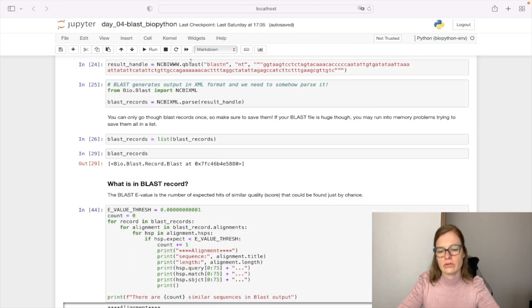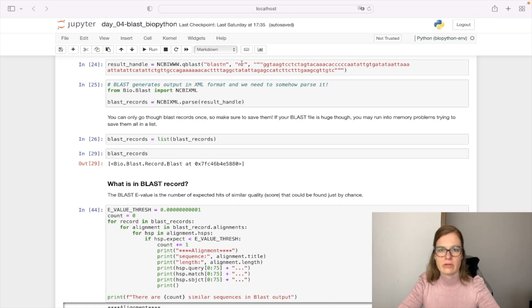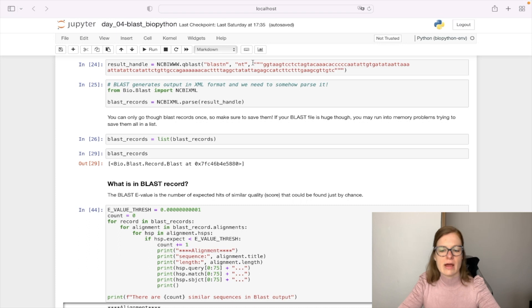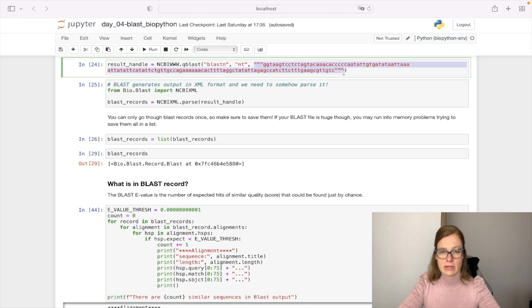We are going to use the qblast function to search with the BLASTN program across the nucleotide database and search for similar sequences to this sequence query here.